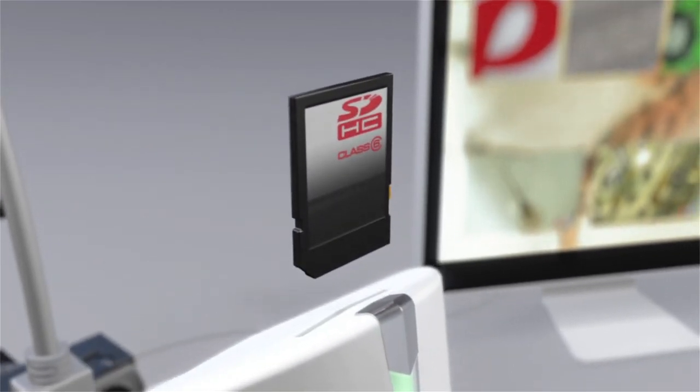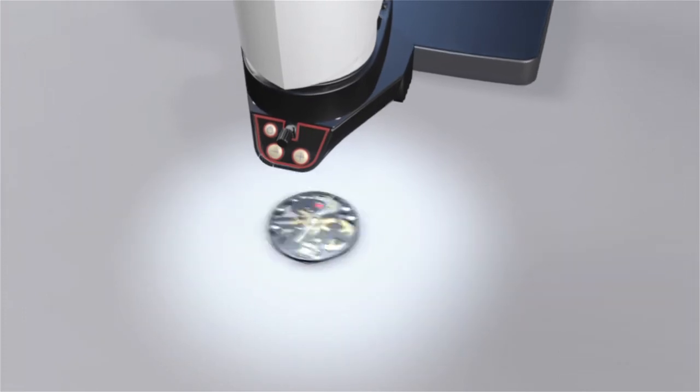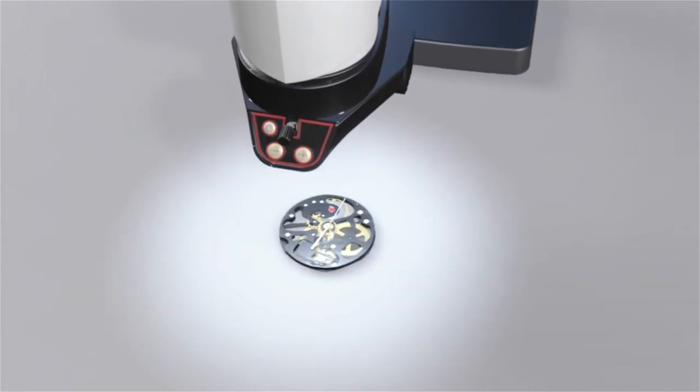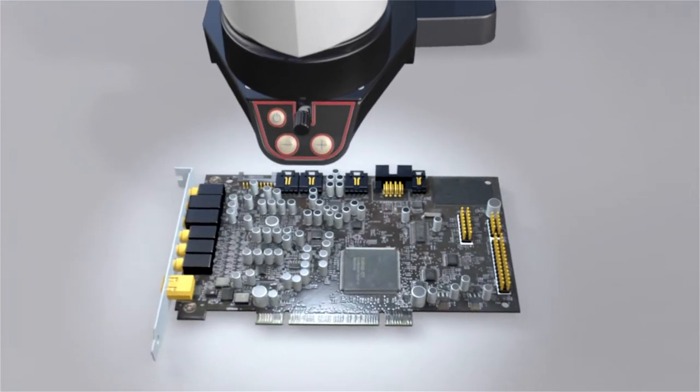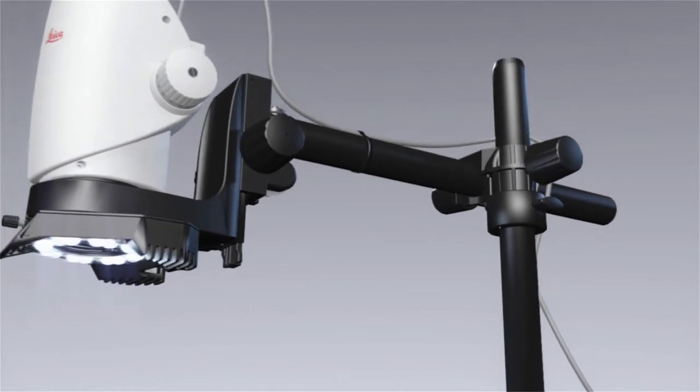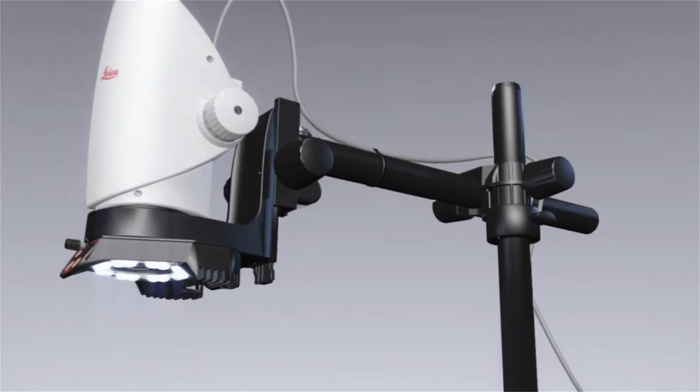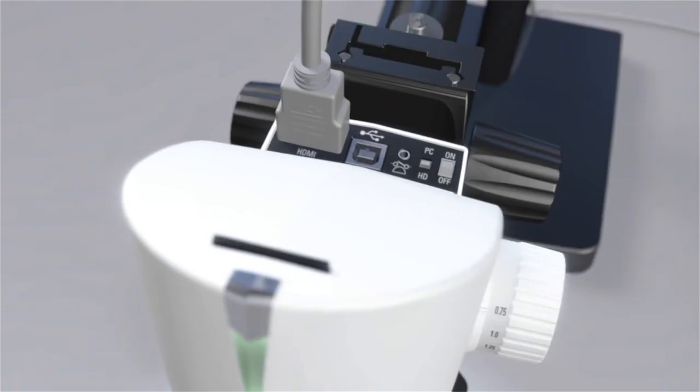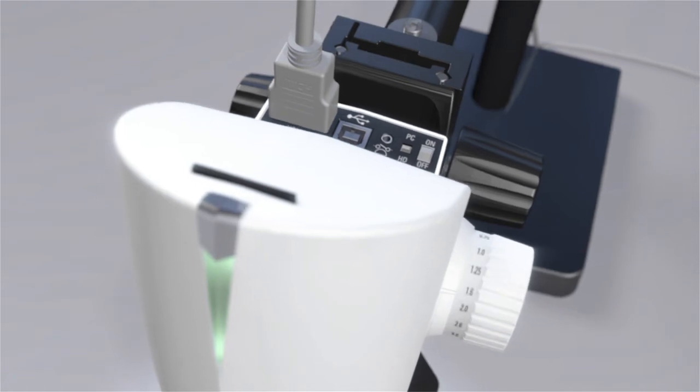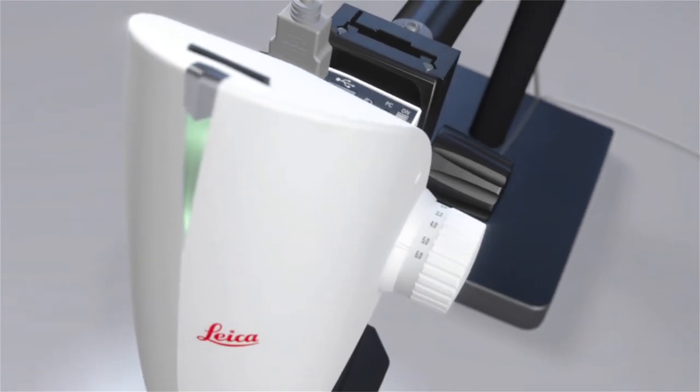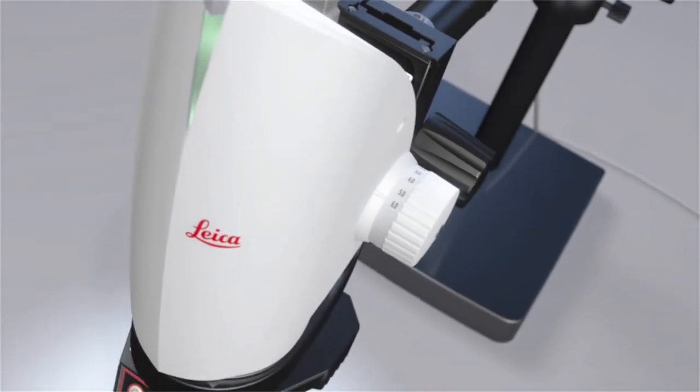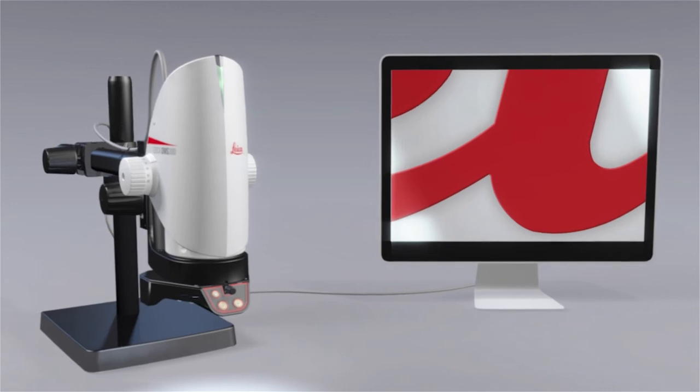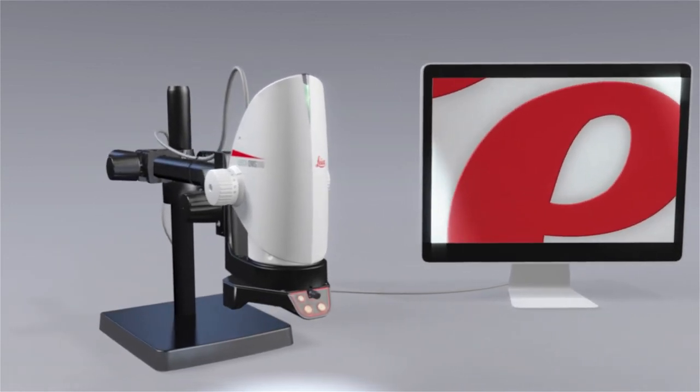Work easily, efficiently and comfortably, even with large samples. The DMS-300 is ideal for your inspection, observation and documentation needs. Fast, simple and ergonomic. Constructed by experts. Made for you.